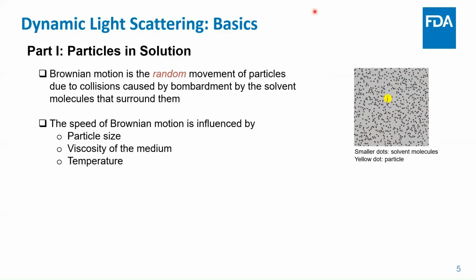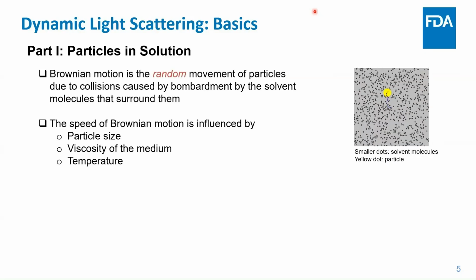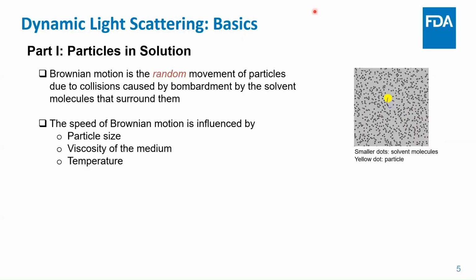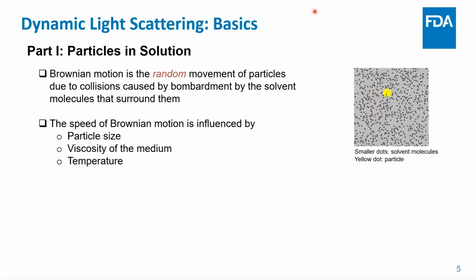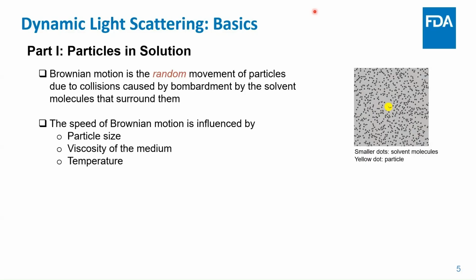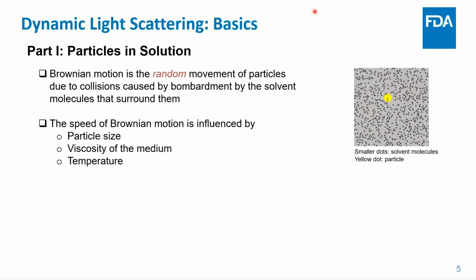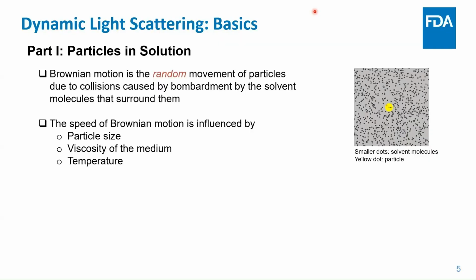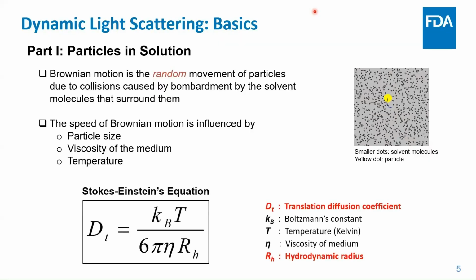So it has a little slipstream around it, and it's actually dragging a certain portion of the solvent molecules around with it. That's called friction. The description of the relation of particle size to the viscosity of the medium, the temperature, and the drag has been mathematically derived through the Stokes-Einstein equation.